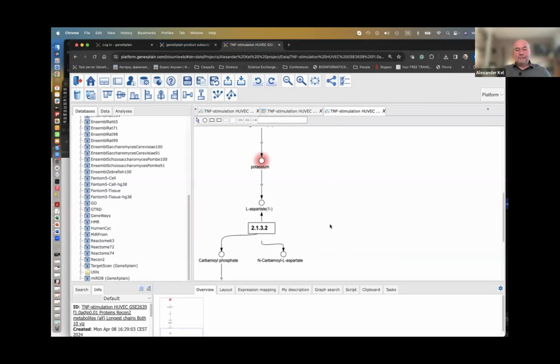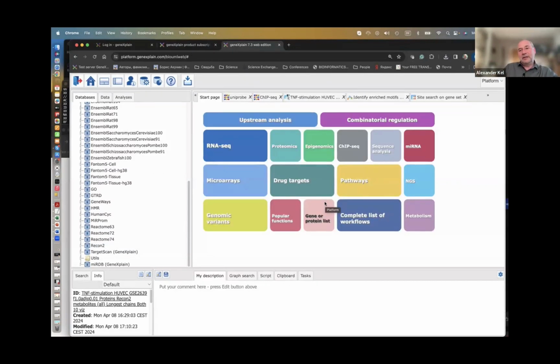All right, so with that, I want to finish my main presentation. The session is still open for your questions. For instance, maybe you're interested in a bit more about the programming access to this tool.